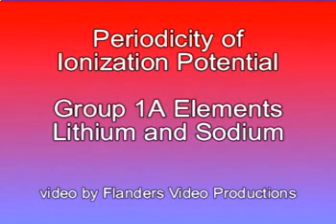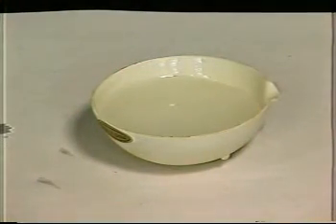In this experiment, we'll demonstrate two things. First, we'll show that elements within the same group tend to perform the same chemistry. And second, we'll demonstrate the practical consequence to the fact that ionization potential decreases as you progress down the periodic table. Here's the setup.